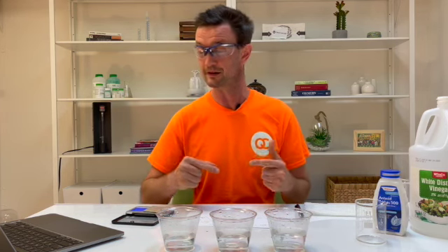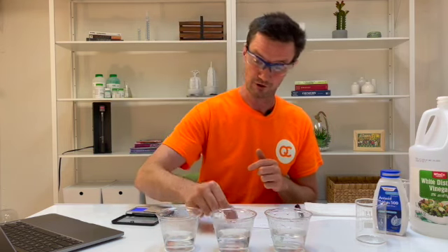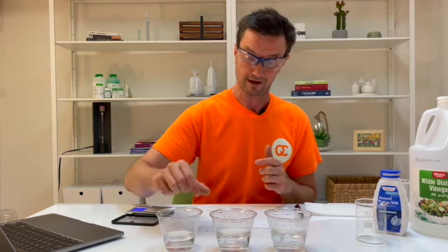Okay, so I have done step number 2. Step number 3 is start your stopwatch right as you put 1 Tum into cup number 1, and then at the 10-second mark, this takes a little bit of planning, put in Tum number 2 into cup number 2. At the 20-second mark, put in Tum number 3 in cup number 3.